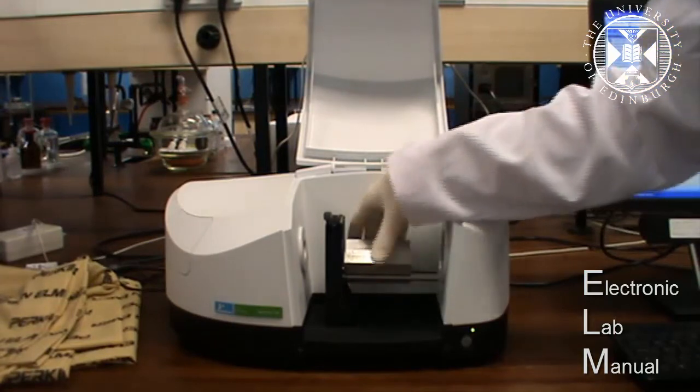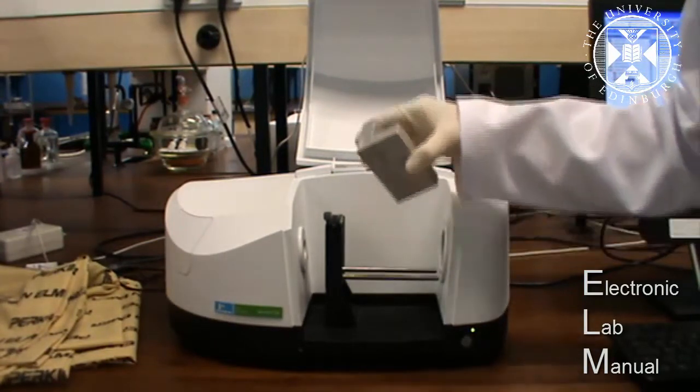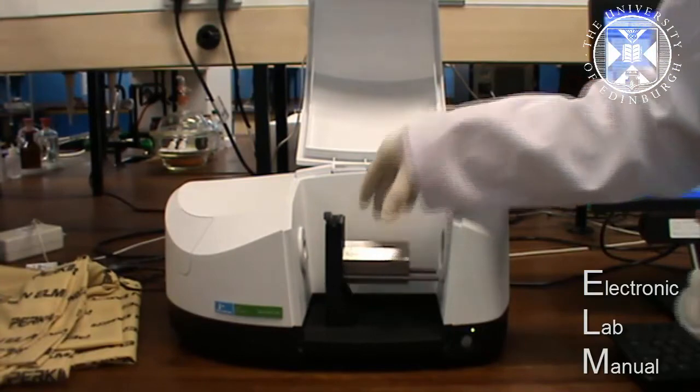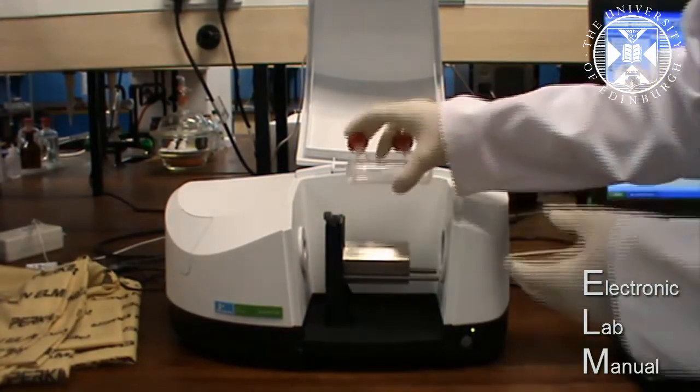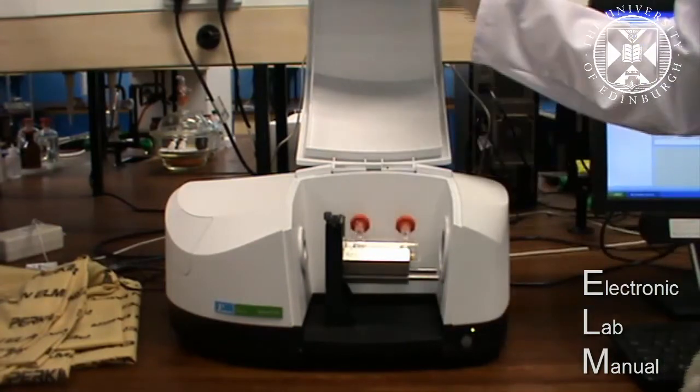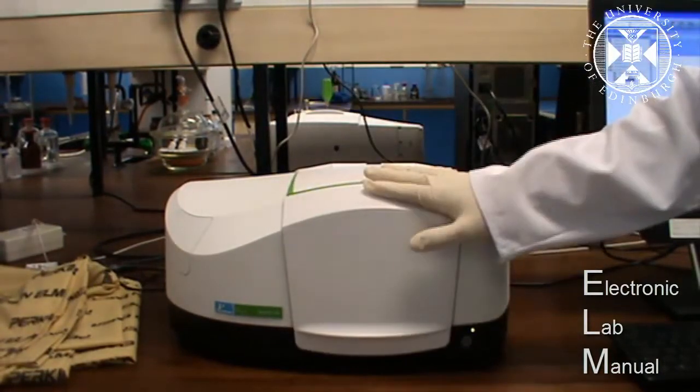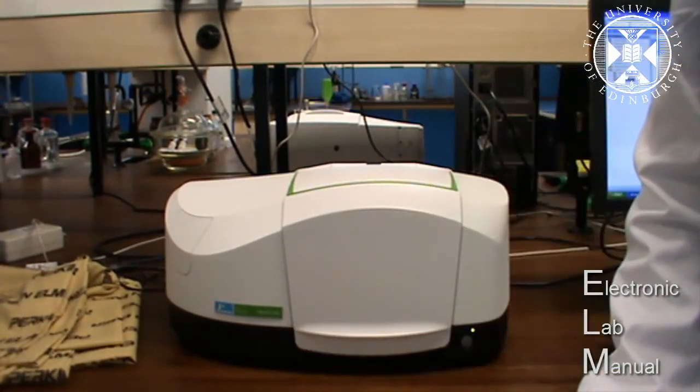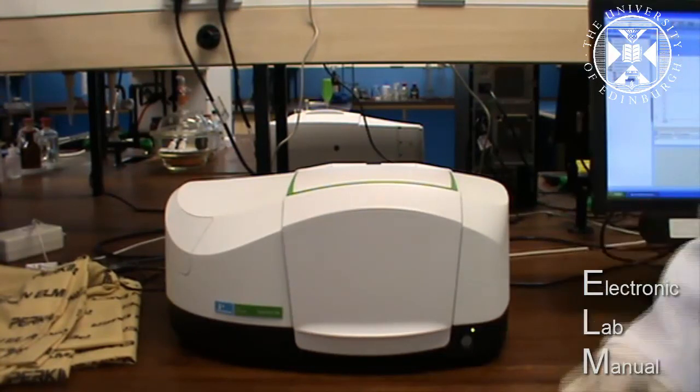We've got this metal block which we place on this railing, and that way the gas cell can be placed in like so. Close the lid and then we hit scan on the program on the computer.